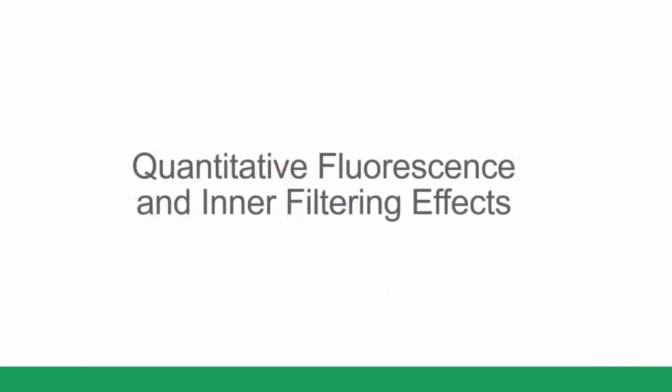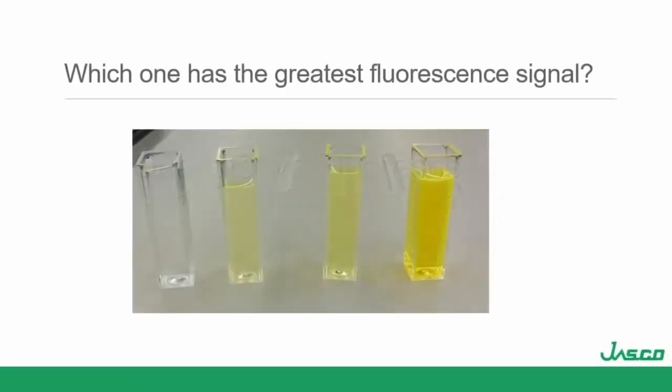Now, one thing that I've found over the years a lot of folks don't think much about are these inner filter effects. So I'm going to close with this and a different look at quantitative fluorescence. So something else for you to consider.